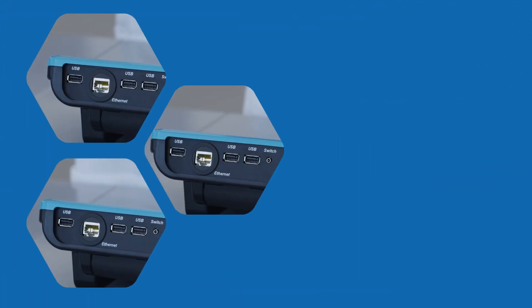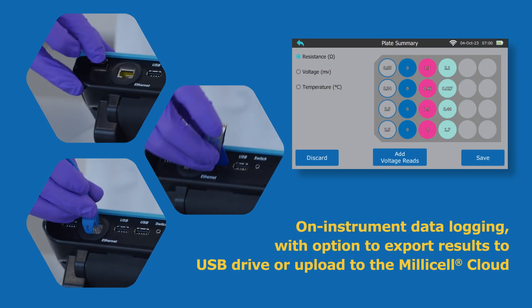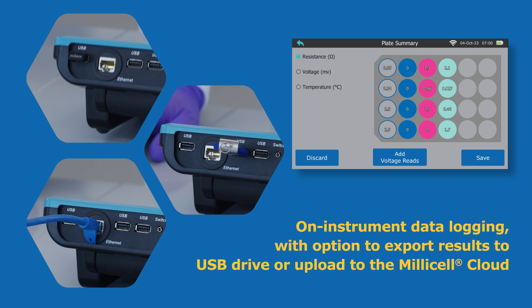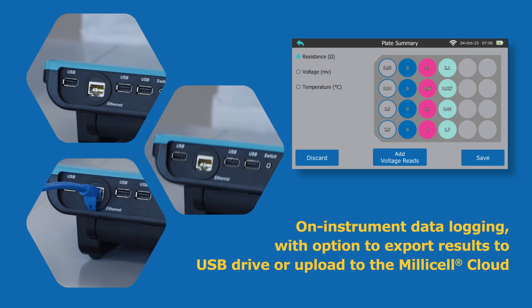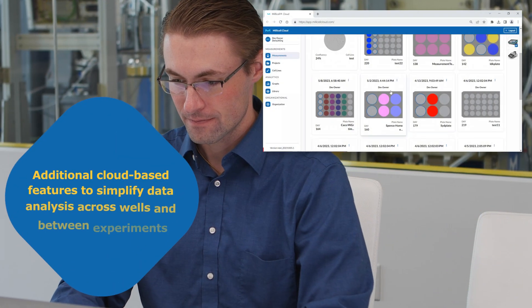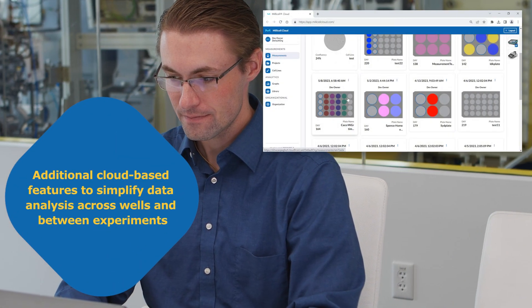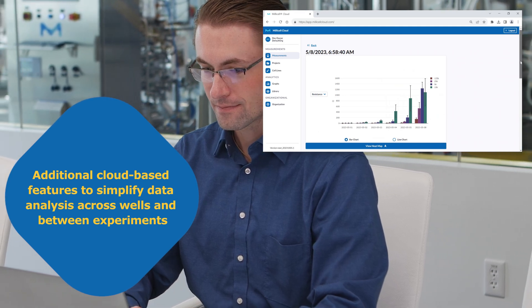Never lose your data with automatic on-instrument recording. Easily export your results to a USB drive or upload to the Millicell cloud via Wi-Fi or Ethernet connection. Our web-based application allows for convenient downstream analysis as well as sorting and archiving of data with greater access.